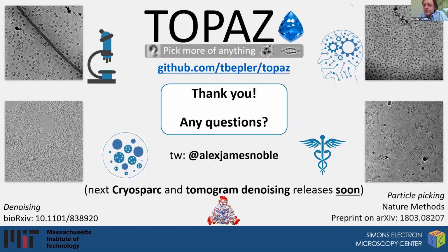Sorry. So as far as I know, there's effectively no size limit, because in the step before training you downsample your micrographs, and all you need to make sure is that the receptive field of the network you're training is bigger than your actual particles. If it's not, then you just downsample more. So if you have some giant particles, go ahead and downsample to 16x the size of your original micrographs, and that should work fine.